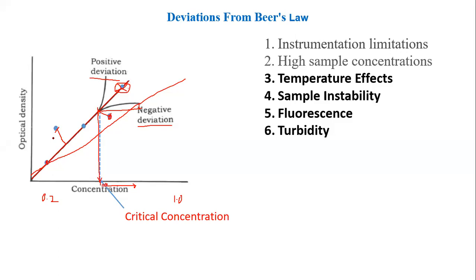Yes, sir. So you cannot arbitrarily choose any points and draw the straight line. You should choose only those points in such a way that when you draw the straight line, on either side of the line, you get equal number of points. Okay, that will make the curve balanced.